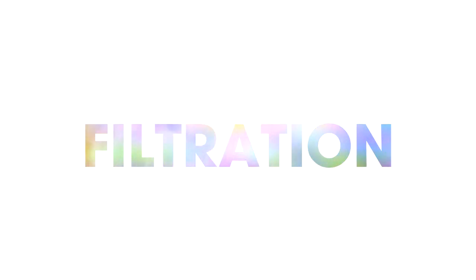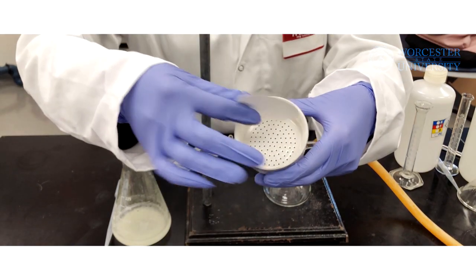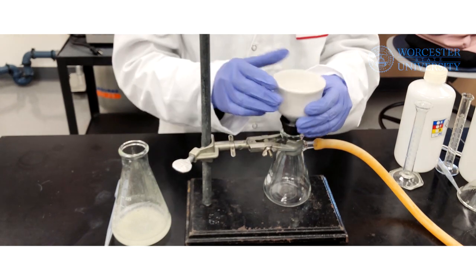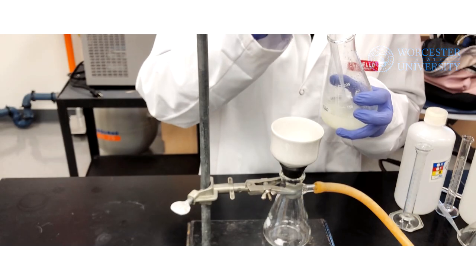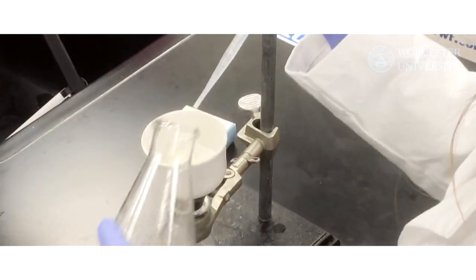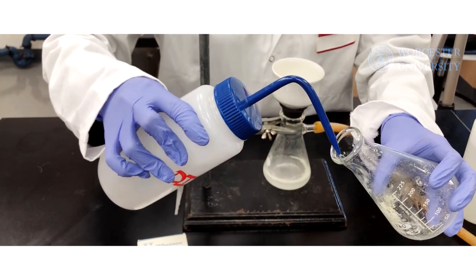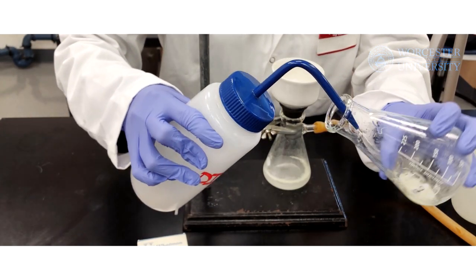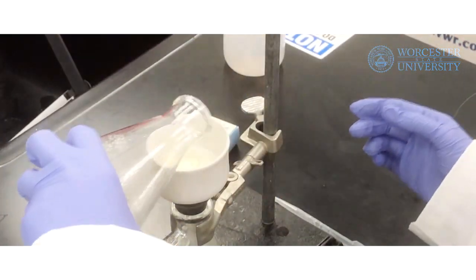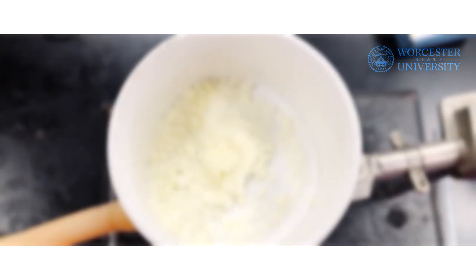Now, you will collect the precipitate from each extraction using vacuum filtration. You will need a fresh Erlenmeyer flask, a ring stand, a rubber hose, and a filtration funnel equipped with filter paper and a rubber stopper for each precipitate. Turn the vacuum on, wash the filter paper with water, and carefully transfer the precipitates into their respective funnels. Wash the Erlenmeyer flasks with small portions of distilled water to transfer all of the precipitate. Then, allow the precipitate to completely dry.